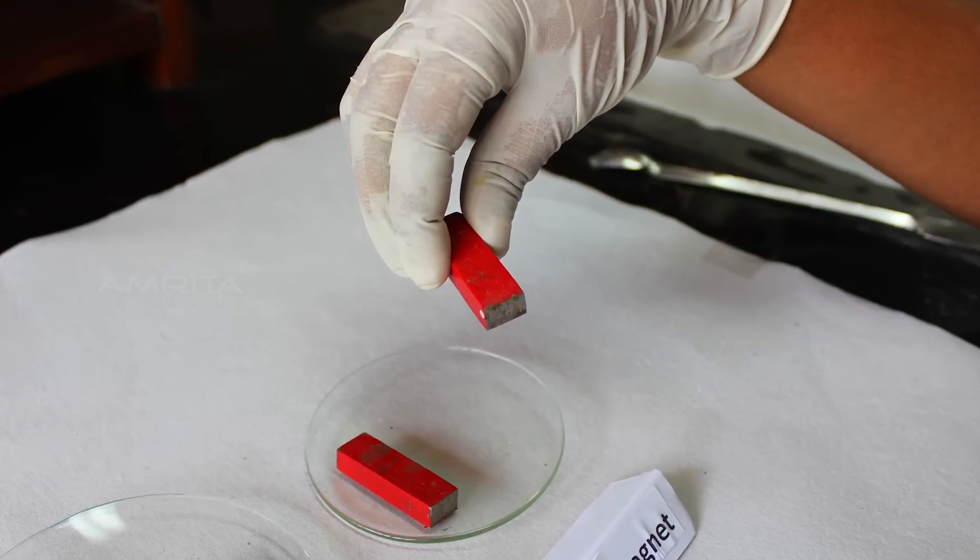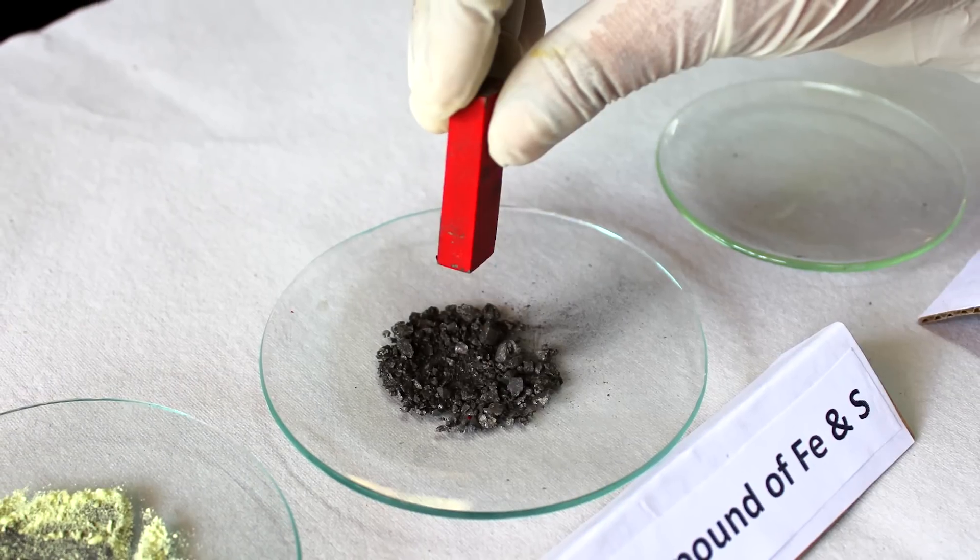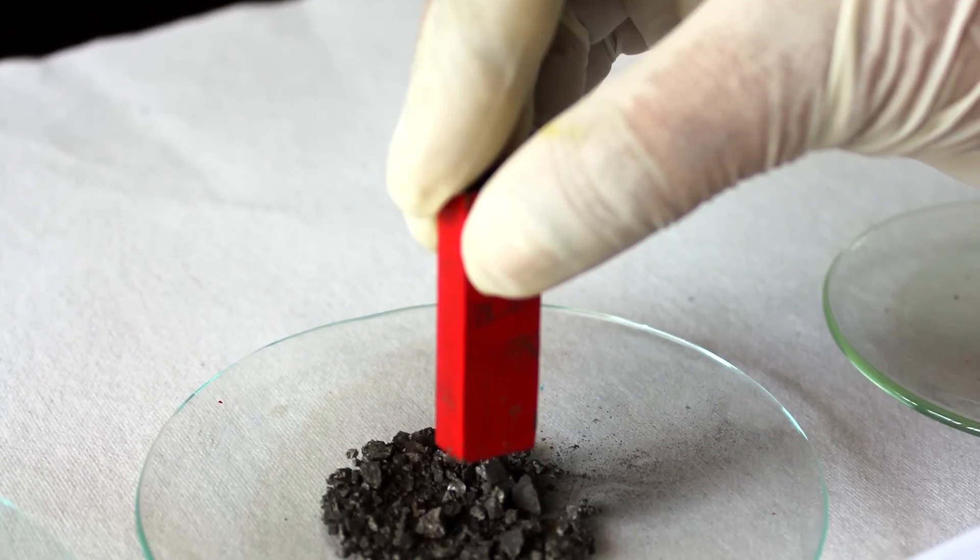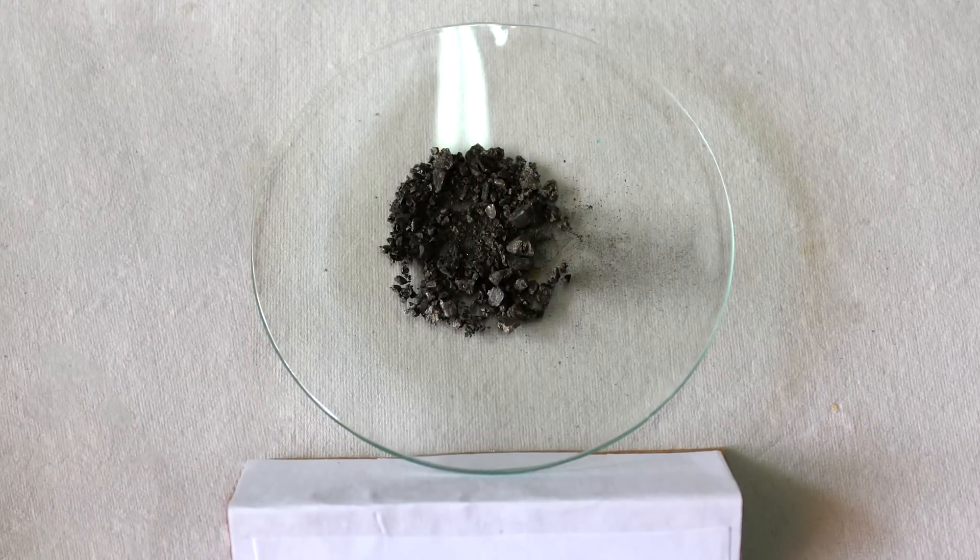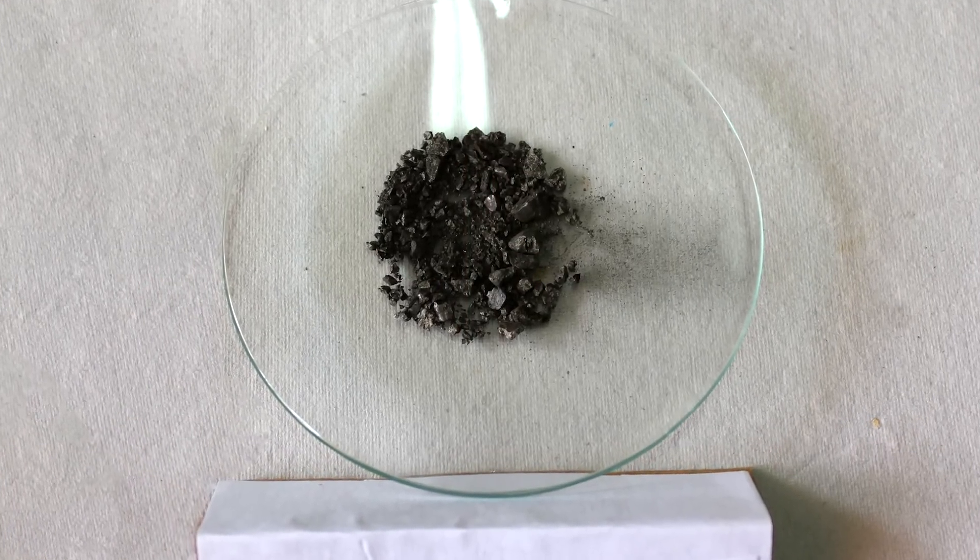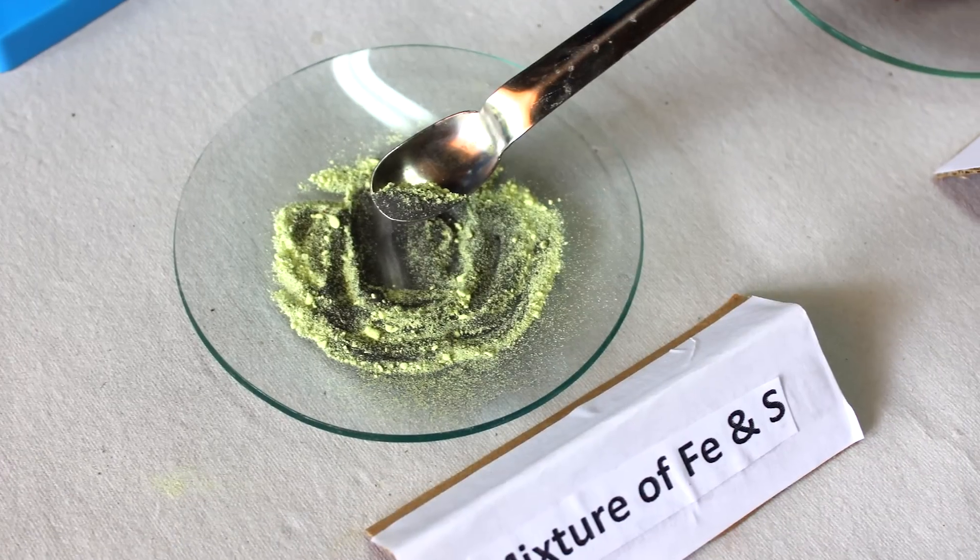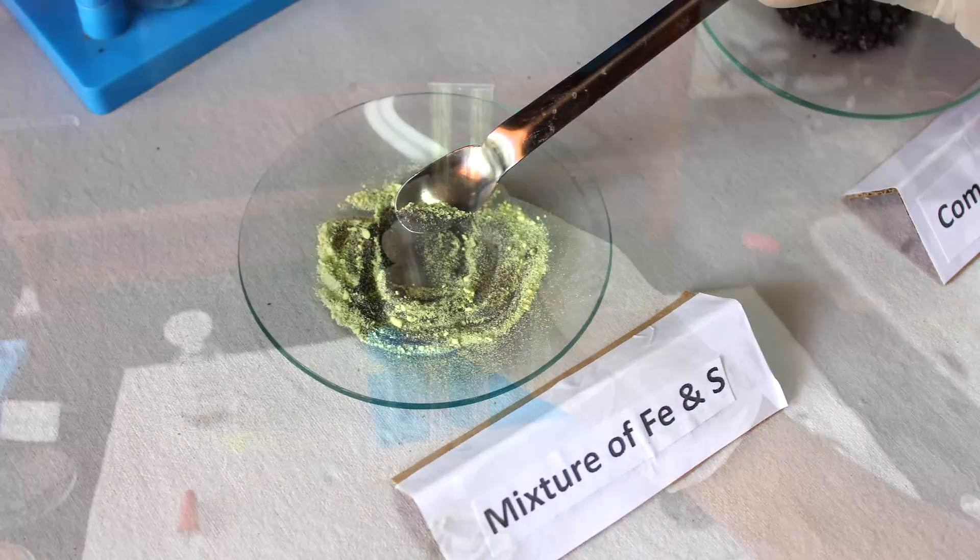Now, show the magnet over the watch glass in which the compound is taken. We can see that no particle attaches to the magnet, which indicates that iron has lost its properties on forming a compound.